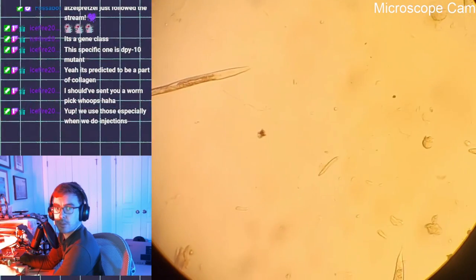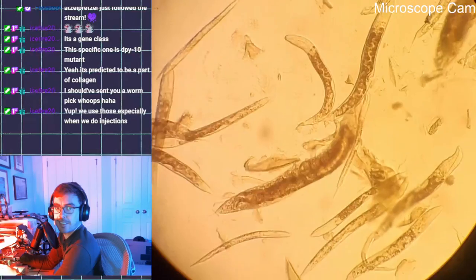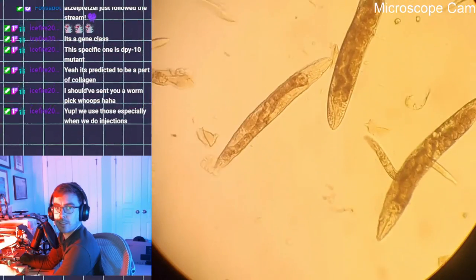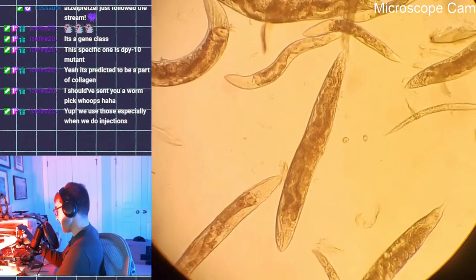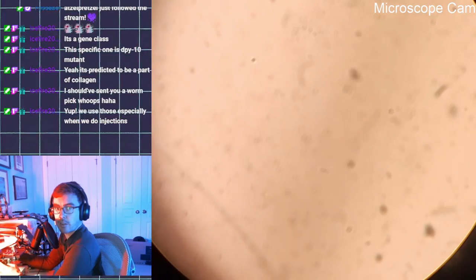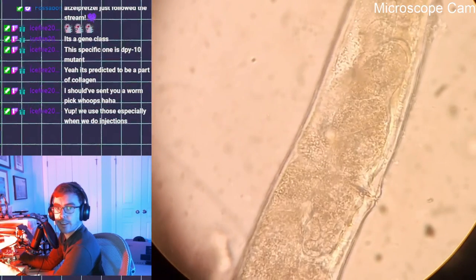So presumably they're more or less the same anatomically, except they're dumpy. Although maybe that makes them harder to look at now that I'm seeing them. So we're going to zoom in all the way and just see what we can see. Hopefully not crushing. There we go.